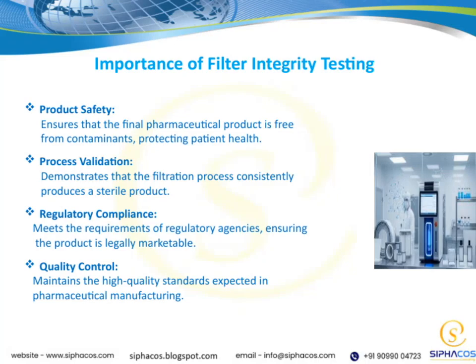Let's talk about product safety first. Ensuring that the final pharmaceutical product is free from contaminants is absolutely essential. This not only protects patient health, but also upholds our responsibility to deliver safe and effective medicines. Moving on to process validation, it's critical because it demonstrates that our filtration process consistently produces a sterile product. Consistency is key here. It's what guarantees reliability and quality every time.